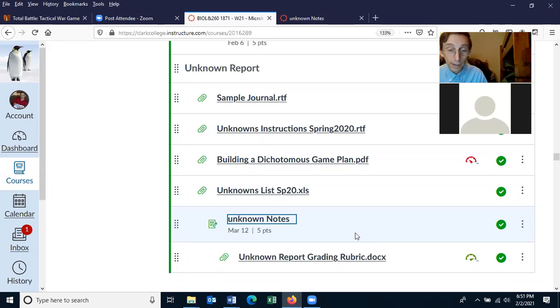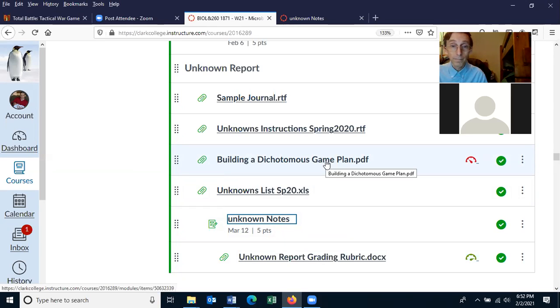That's the only time you will get 3 tests on one day. But remember, you're not running 3 tests on one day, because you're starting the gelatin test today, assuming I get your unknown number to you today. And you're going to be starting the gram stain on Sunday and the lactose fermentation on Monday. So you will be doing a dichotomous game plan. Okay? And I'm doing it this way just to reduce the number of contacts between me and the students. And all of these contacts are going to be done in the unknown notes. All right? Any questions?